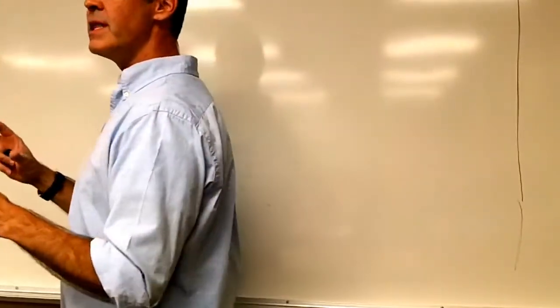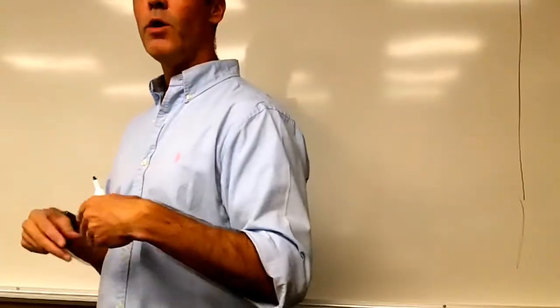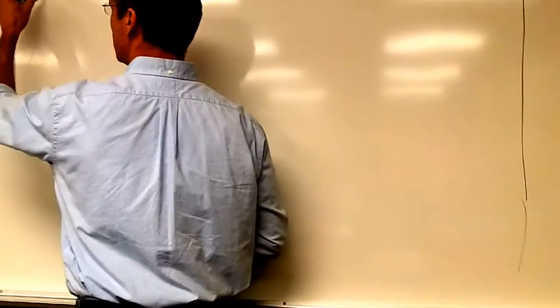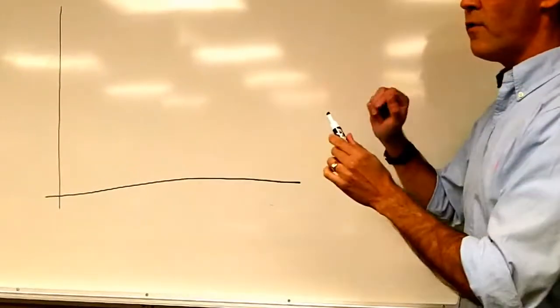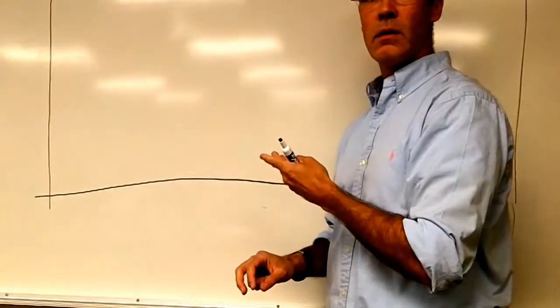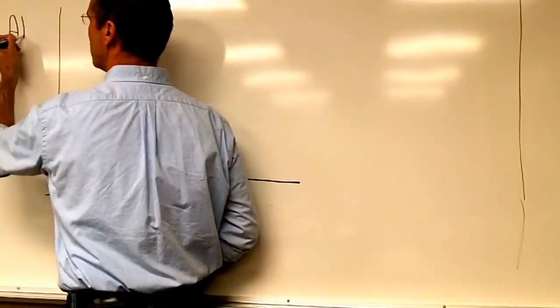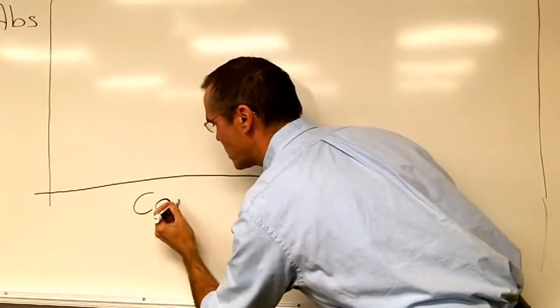So the first thing that you need to do whenever you're doing something like that, like when you want to set up an experiment and find the unknown, is a graph. Okay? And on this graph, you have, of course, two axes, right? And what you're doing here, you're measuring the absorbance as a function of the concentration.